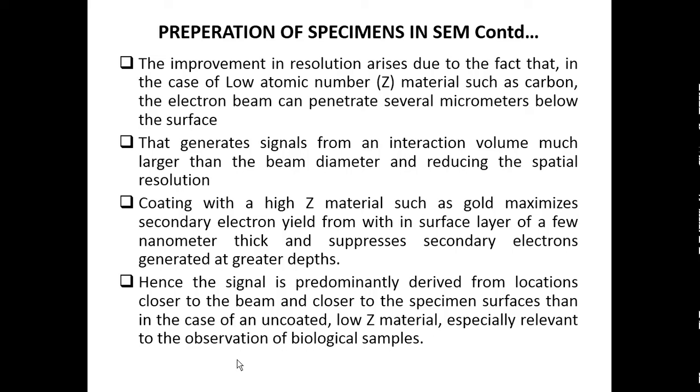Whether it touches the top of the sample or not, the signal has to pass through all these lenses and all those things.